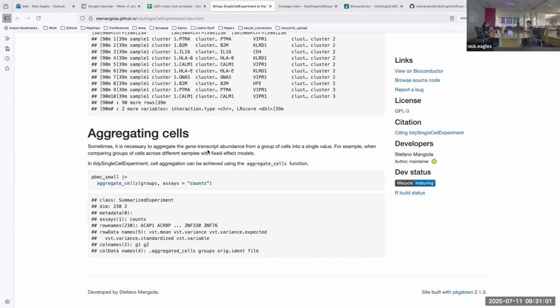But it's not clear to me when the manipulation is occurring in place or in memory. Yeah, something like that. It's the part that I'm missing here. I need to scroll a bit more, but this is the part that I don't fully understand. Yeah, actually, I think that is the most confusing part.